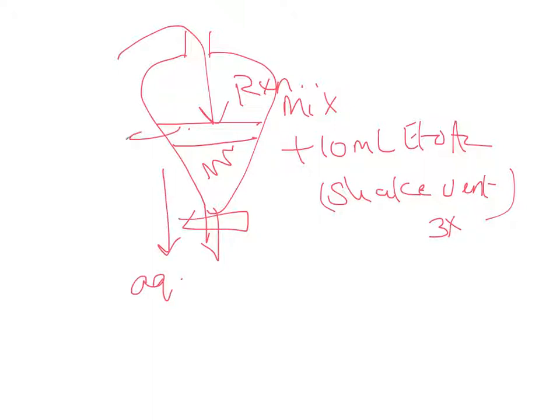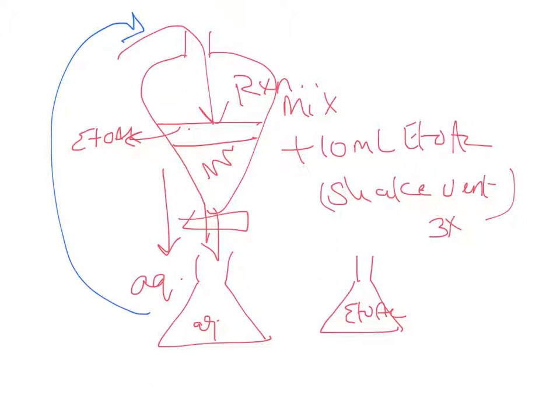Because ethyl acetate has a different density, it picks up your product while chromium salts remain in water—you'll see two layers form. Drain your aqueous bottom layer. The ethyl acetate layer is on top—collect it in a flask. Pour the aqueous layer back into the sep funnel, add another 10 milliliters of ethyl acetate, and repeat. Discard the aqueous layer into waste and mix the ethyl acetate layer with the previous one. Total you'll have 20 milliliters of ethyl acetate with dissolved cyclohexanone.